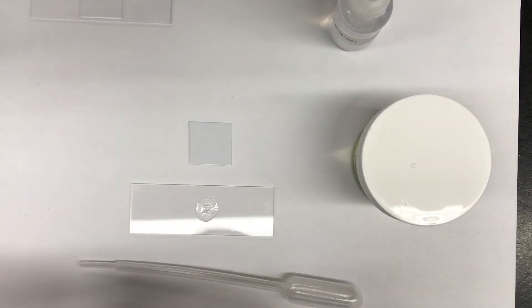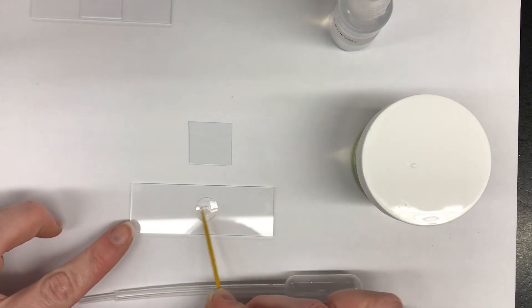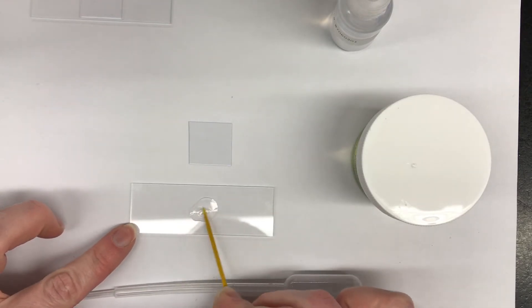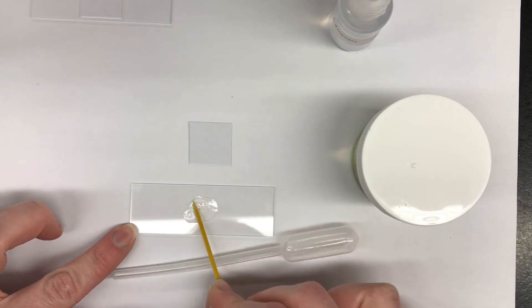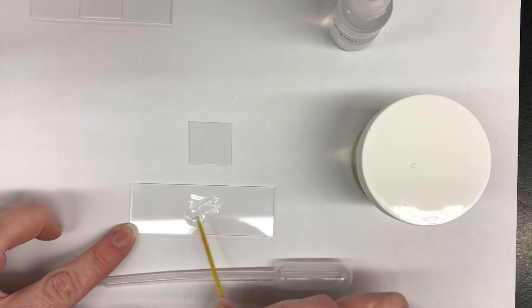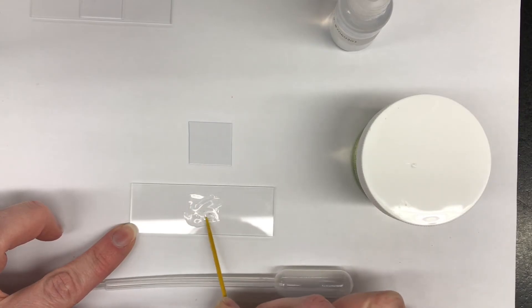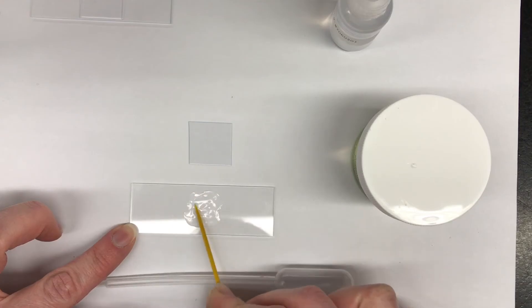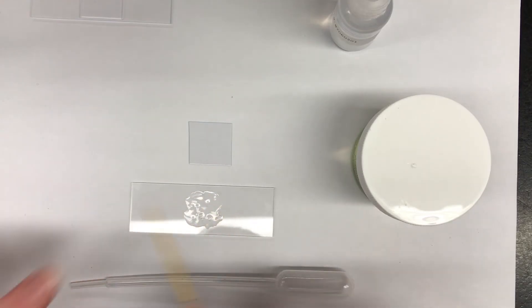We're going to take the toothpick and spread it out, try to get rid of any bubbles, and try to spread out the protosloe.